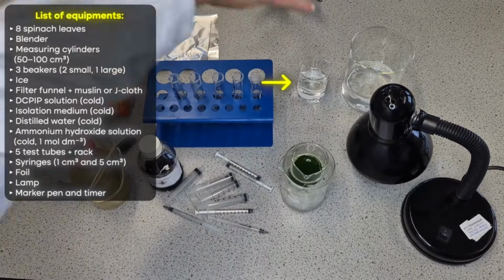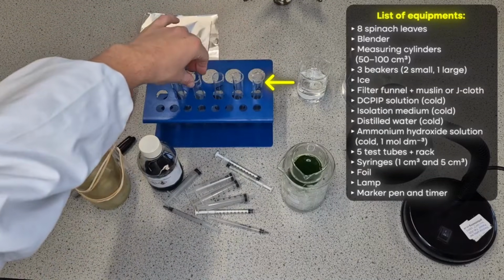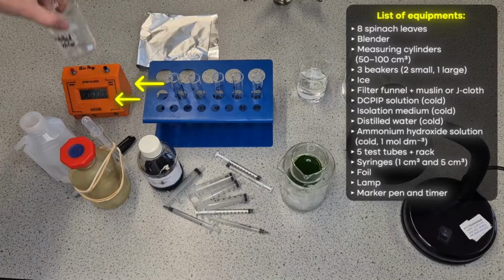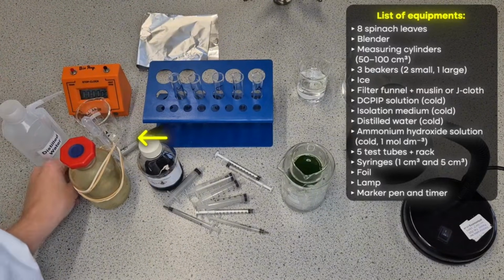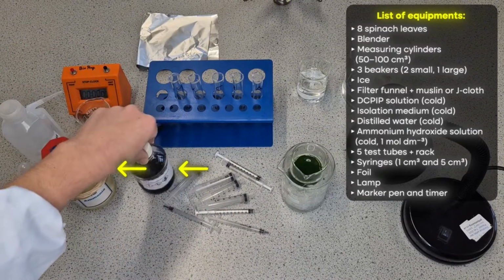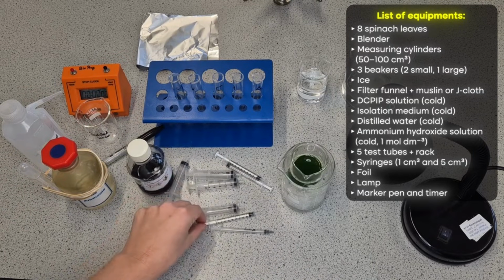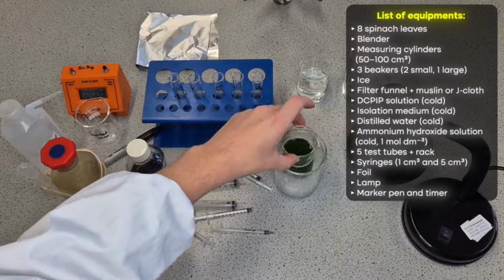Got a beaker here of isolation medium, 5 test tubes labelled A, B, C, X and Y. I've got some foil at the back, a stop clock, a beaker to put my distilled water in, as well as my distilled water, permanent marker to label my test tubes. I've got my ammonium hydroxide, DC-PIP, and then a selection of 5 centimetre cube syringes and 1 centimetre cube syringes. I've got my chloroplast suspension pre-made on ice.